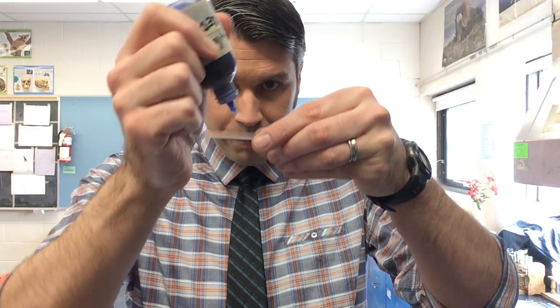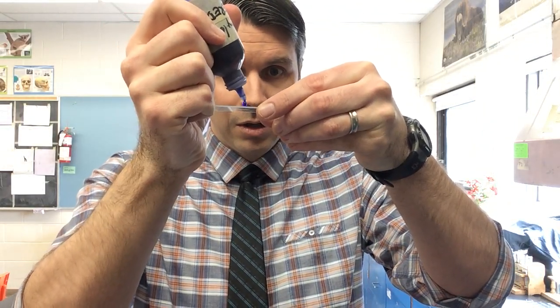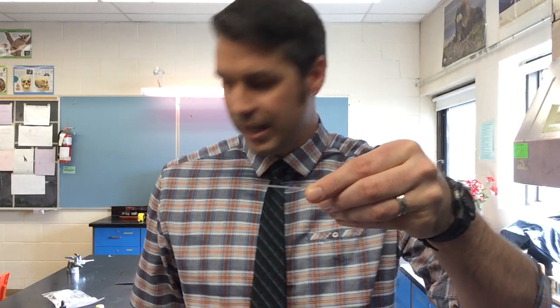So now we have all sorts of cheek cells here on our slide. What we're going to do next is add a drop of stain. Stain is just like its name — it stains. It's going to stain your cheek cells blue, so if you get it on your clothes, you'll stain your clothes blue too. You're going to put one drop right in the middle. Only one drop — don't put more, you'll make a mess.